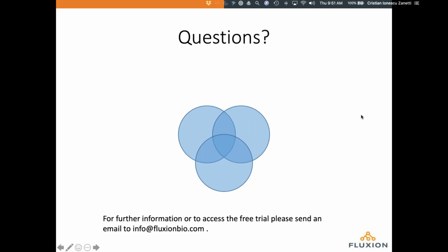There's another question regarding target capture data: can you create background models for targeted capture data as well, or only for amplicons? The answer is yes. We haven't done a lot of that work. Amplicons are a little bit easier because every read covers the same region in the genome, so you have a guaranteed uniform depth at each position on your panel. However, if you use a targeted approach, at the endpoints you might have different coverage away from the probe, but I don't believe that's an insurmountable issue. So I think the answer is yes, we can create background models for target capture data.